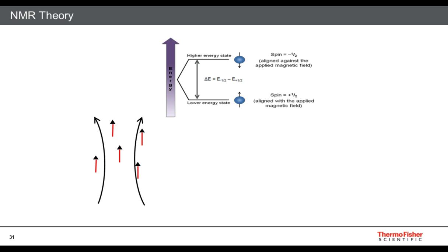And talking about the two different energy states and the relationship of that to field strength and the size of the magnet is oftentimes where we stop the theoretical discussion of NMR at that entry level. When we come back to it, we start to think about, well, how do we actually record the measurement? And that's where it really gets interesting.